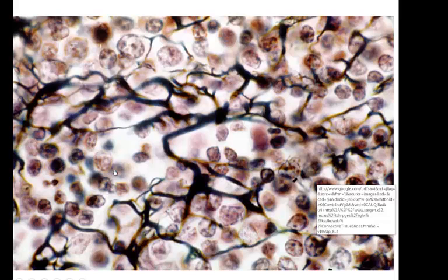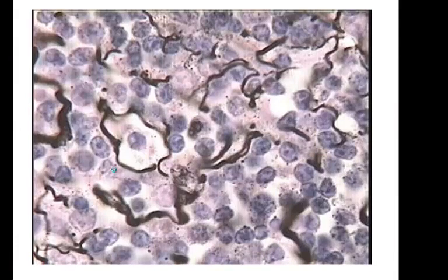Let's look at another picture of reticular tissue. There's another reticular tissue. And what kind of fibers are these? These are reticular fibers. And so this is probably again in the spleen. And these are just white blood cells in the background. Now on Lab Practical Day, I'm not going to ask you what cell types these are in the background. I'm going to ask you, what is this tissue? Identify it. If you identify it, it's reticular.